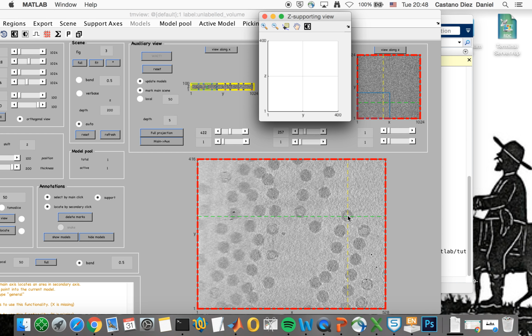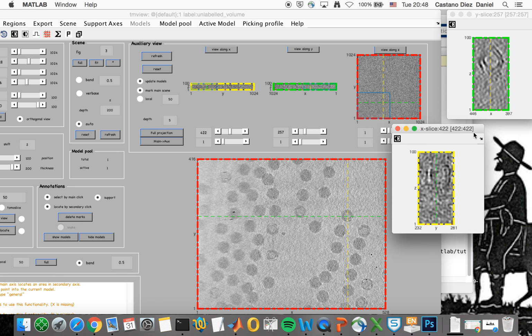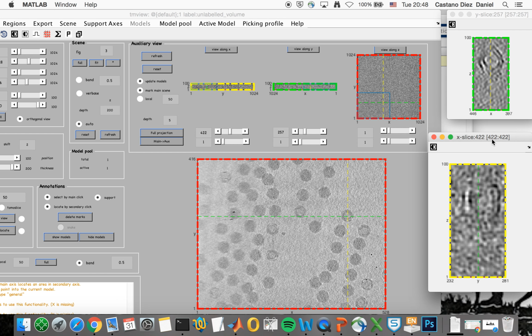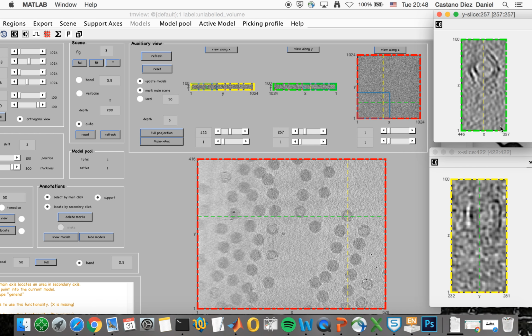And Dynamo thinks a little bit and creates this depiction, which, well, you can see what it means. This green color is the same green that you have here.